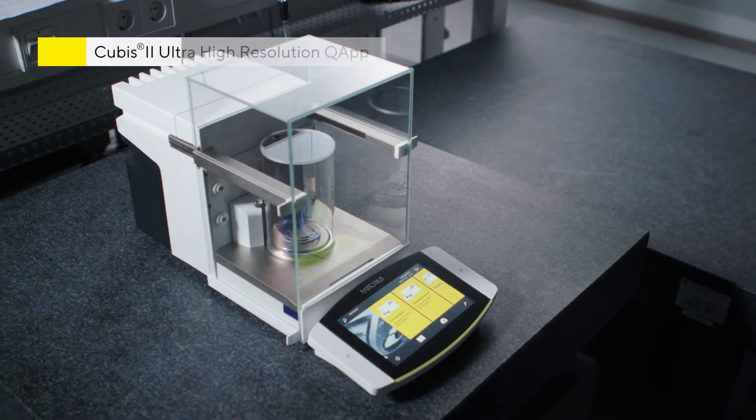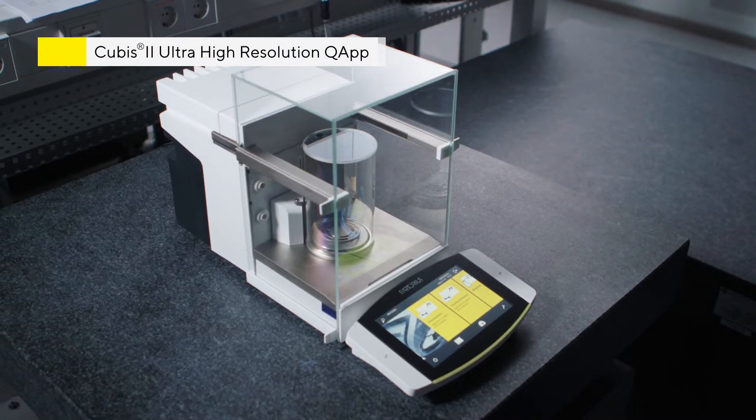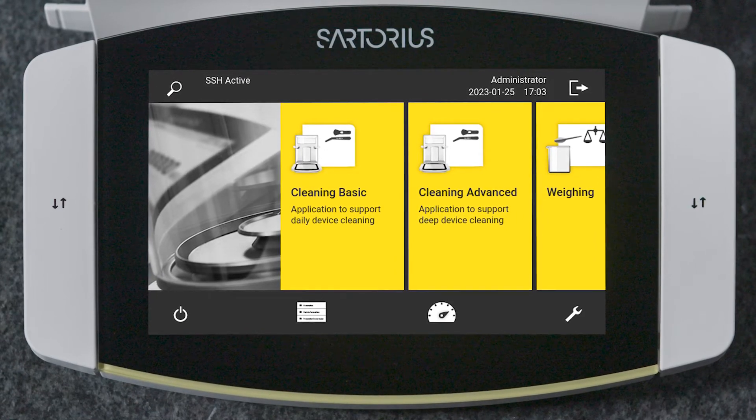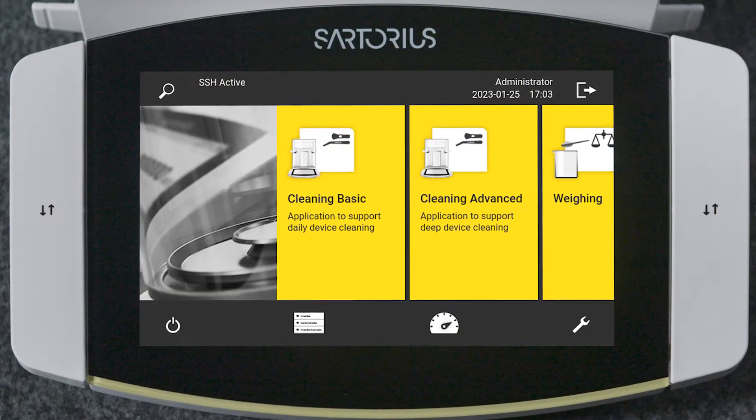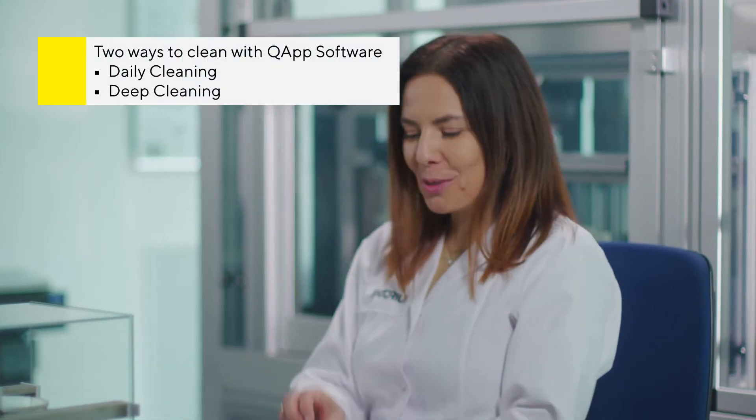Sartorius' new generation of Cubis II Ultra High Resolution Balances come with a new cleaning app. This app, with its built-in guidance, makes the process more intuitive and hassle-free, giving you the confidence that the cleaning was executed according to the manufacturer's recommendations. Let me show you just how easy it is to clean.